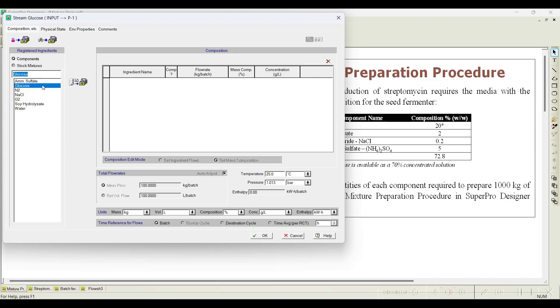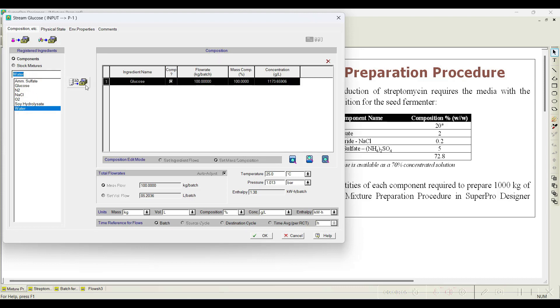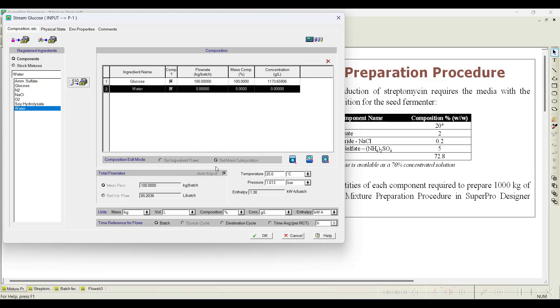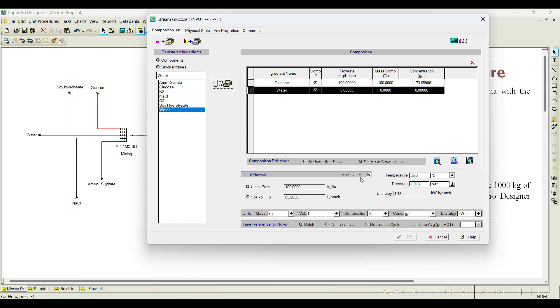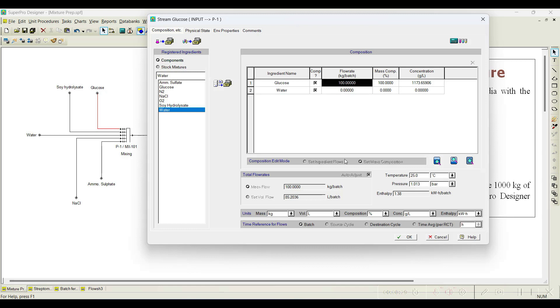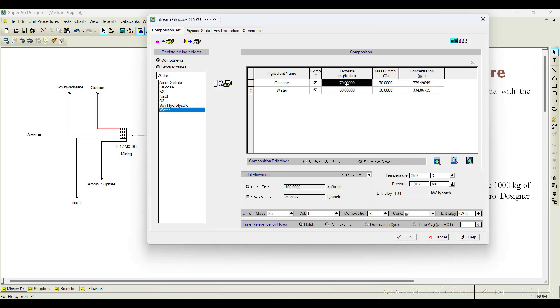Let us initiate the glucose stream first. The problem states glucose is available as a 70% solution, so I will set it as 70% glucose and 30% water. Notice that by default the flow rate is 100 kg and is locked — auto-adjust is checked, so the flow rate cannot be set manually; only composition can be set. Click OK.